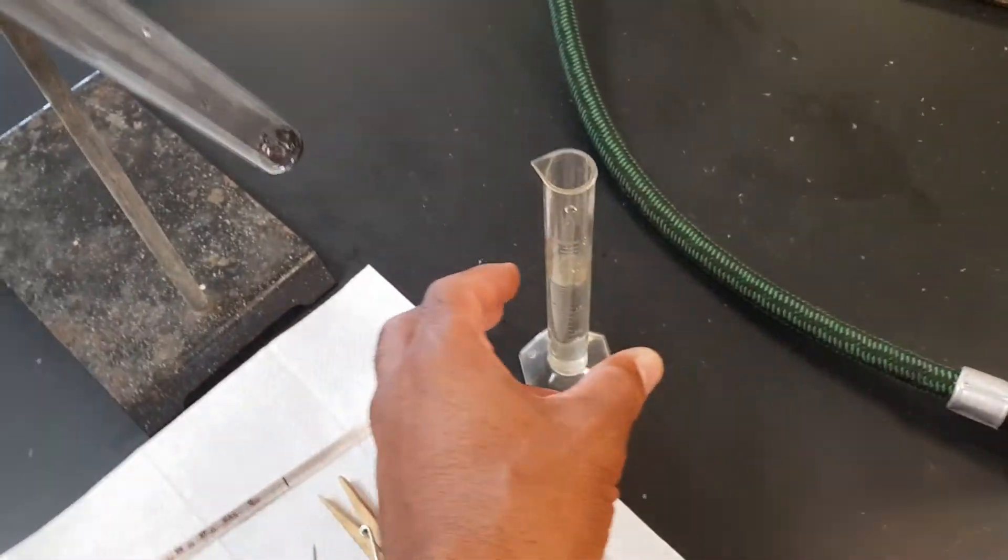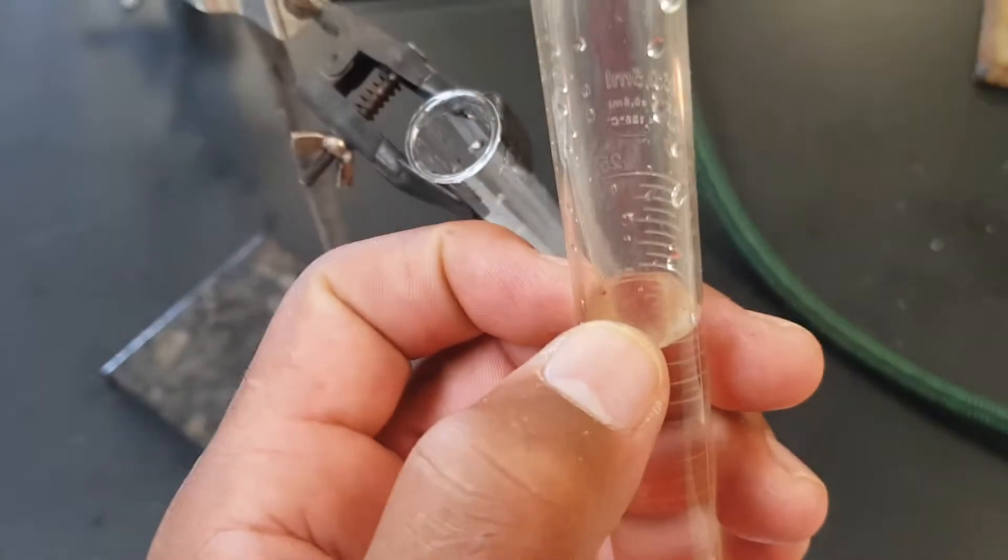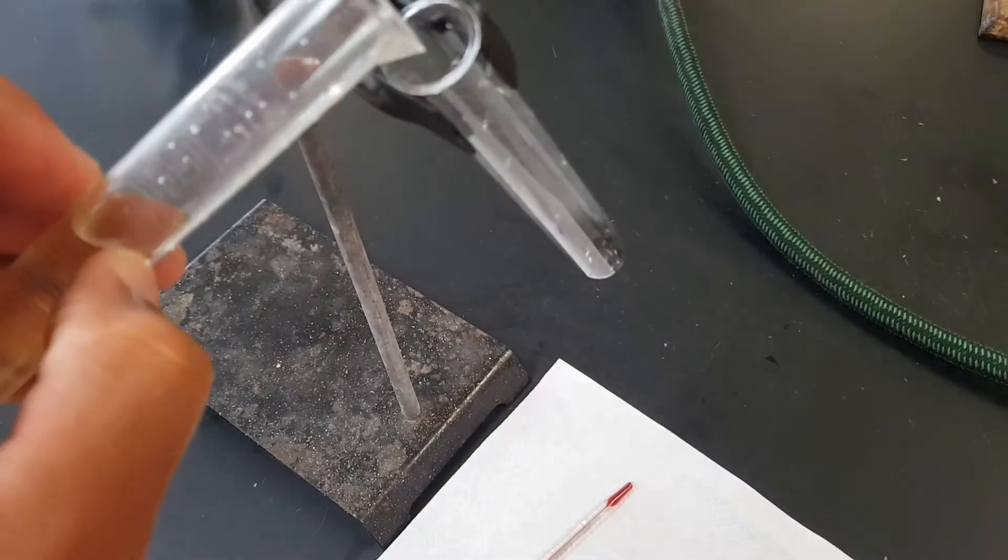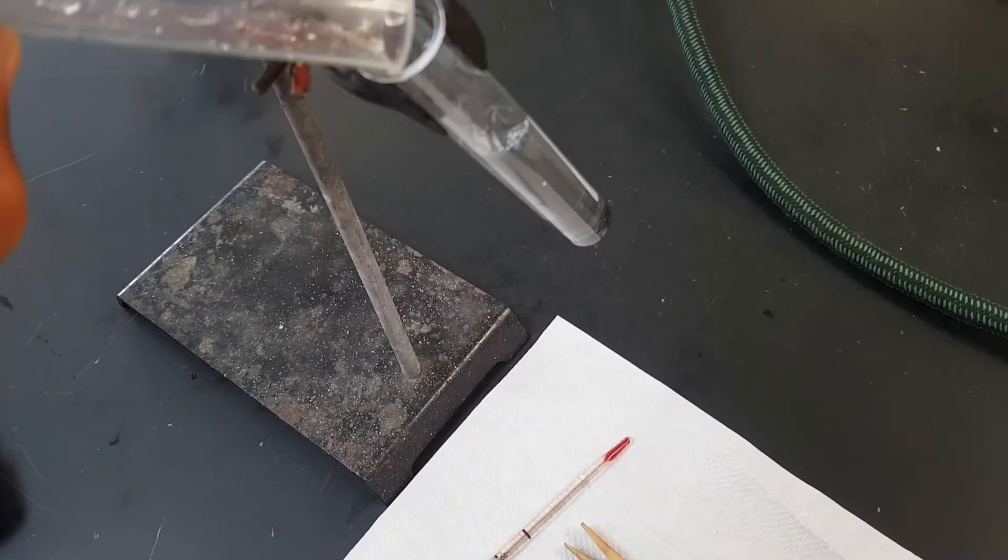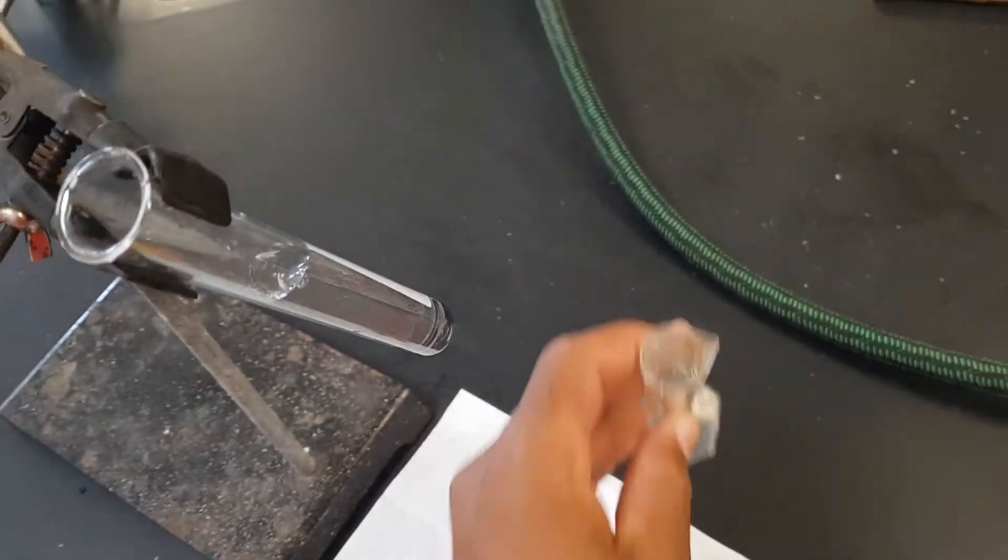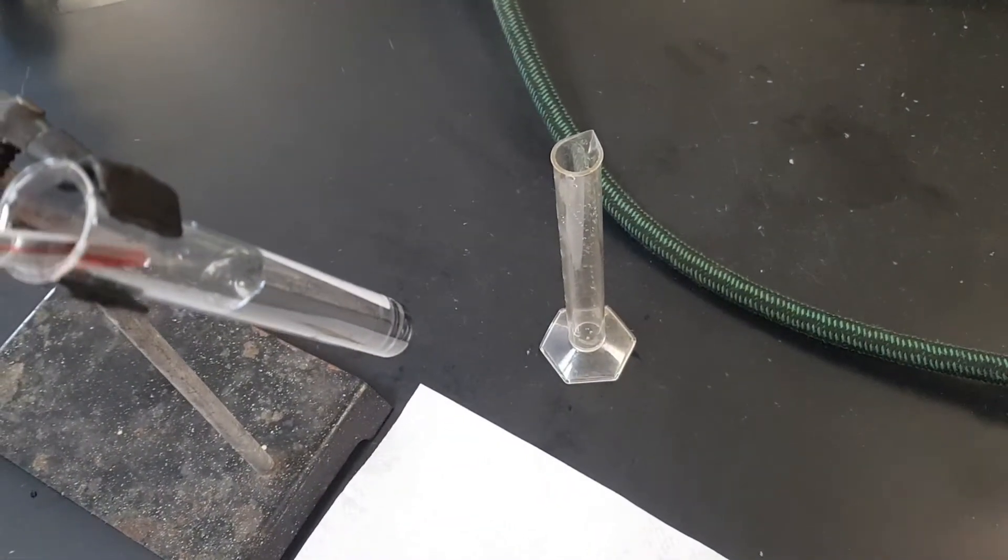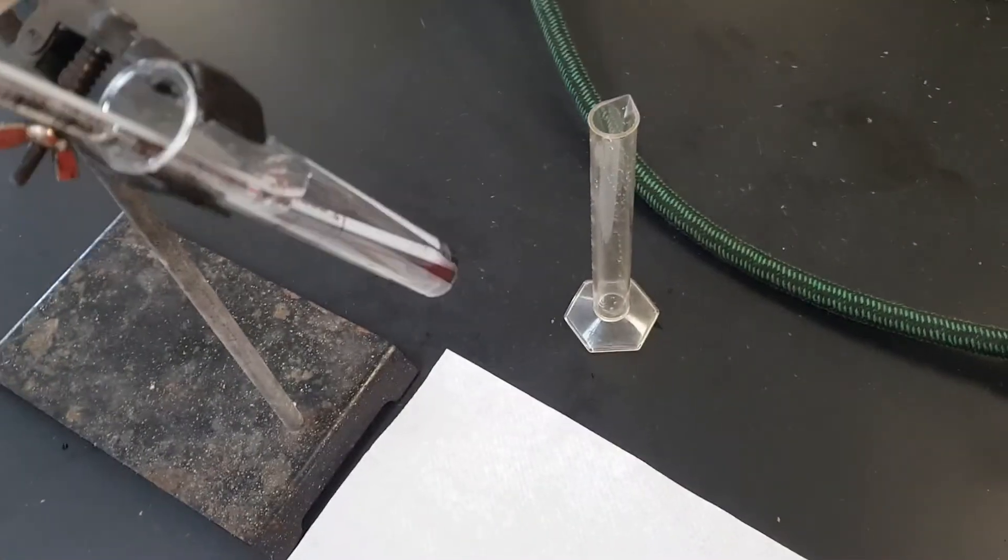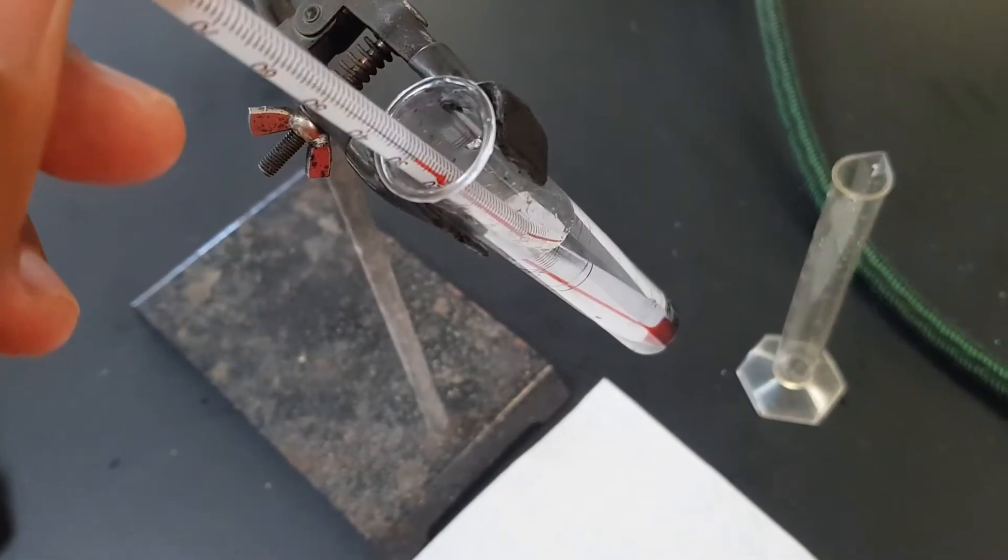So the first step you want to do is to measure water to 20 ml. This is already pre-measured so this is 20 ml. Pour the water into your test tube. Once you have done that, the next step is to take the temperature of this water. That's the initial temperature of the water. Make sure you record the initial temperature of the water.